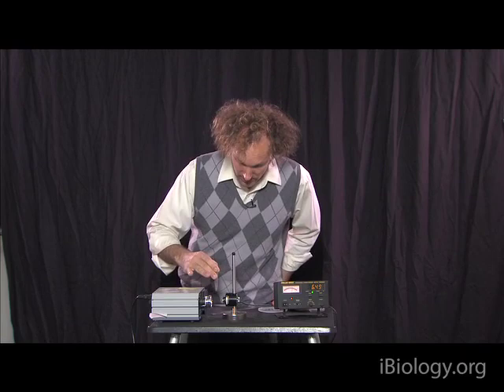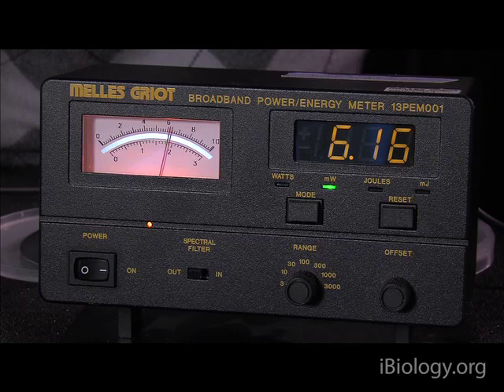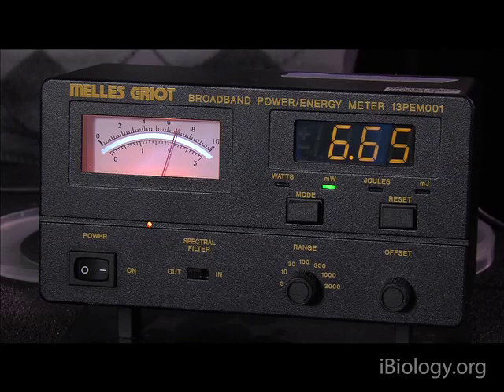And we might expect, if I put this in the path, that my detector would not go down too much. So if I move it in the path and move out, move in, move out, when I'm in, you see a slight reduction, and that's because of reflection from both surfaces of the quartz, but most of the light is getting through. Okay, so let's contrast this with this thing here.